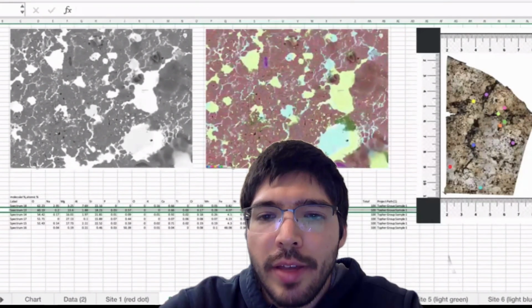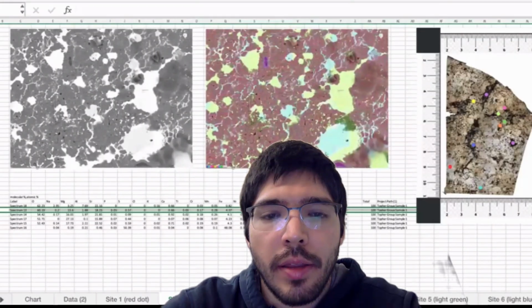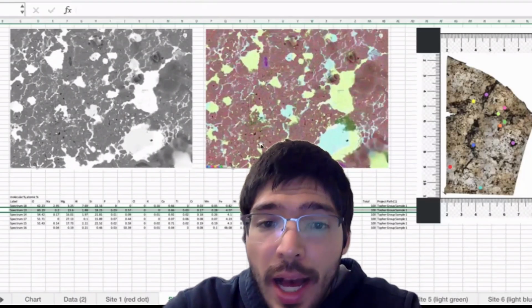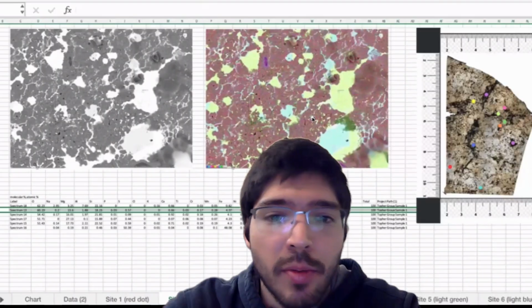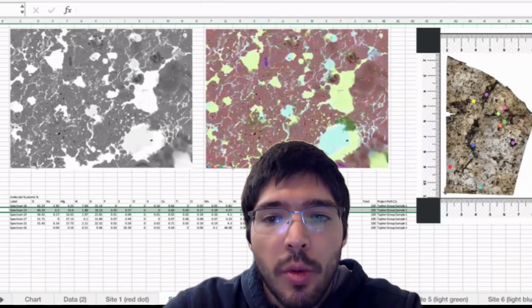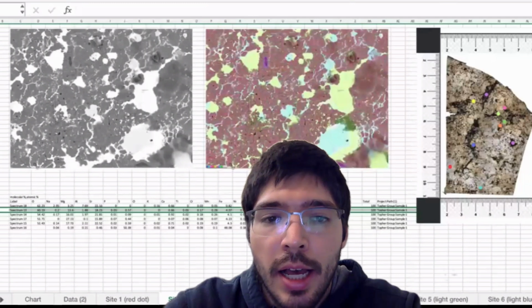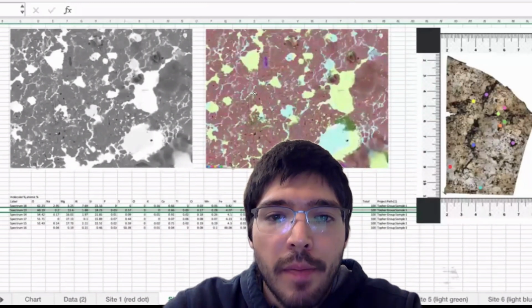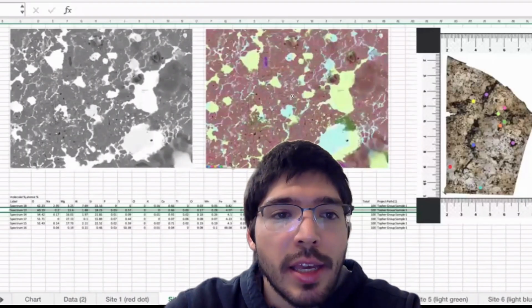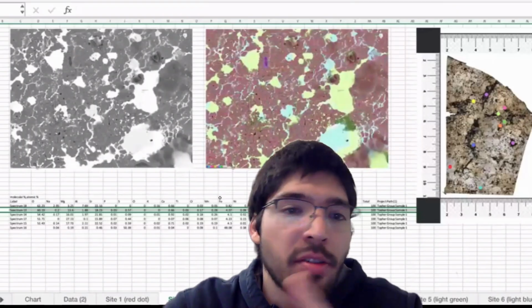So clearly, this is where the petrography section is extremely important in the Meteoritical Bulletin database. For example, I'm not going to list the chemical compositions of any of these potential high pressure polymorph phases in here. I can't really guarantee it without a different kind of analysis. But what I can say at least is that within several shock melt veins, several minerals or grains were observed that potentially matched with a high pressure polymorph.